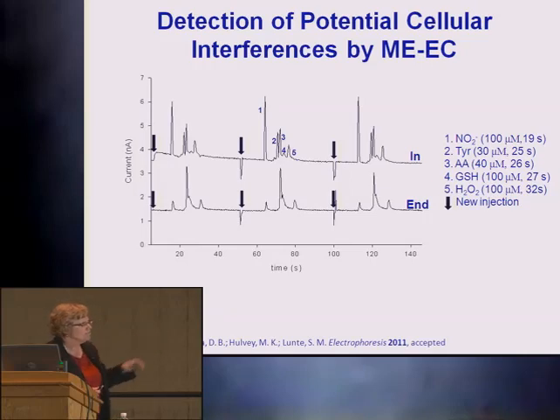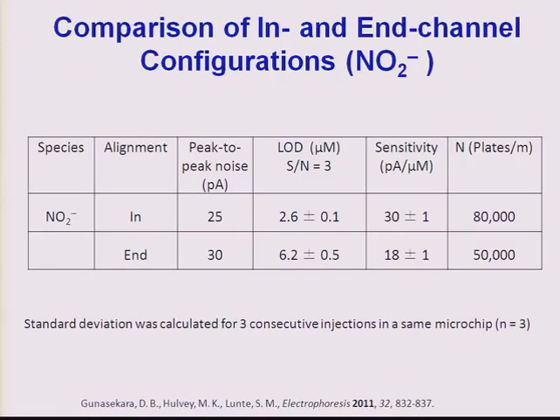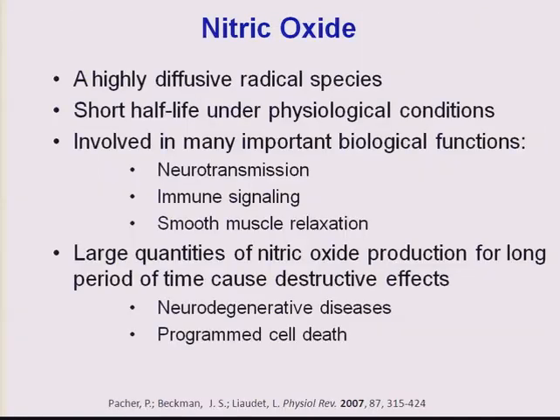One of the, not drawbacks, but one of the considerations for in-channel detection is that you do have to readjust your electrode potential for detection to take into account the separation voltage, which will influence your actual detection potential. And again, you get better separation efficiencies using in-channel versus end-channel detection.